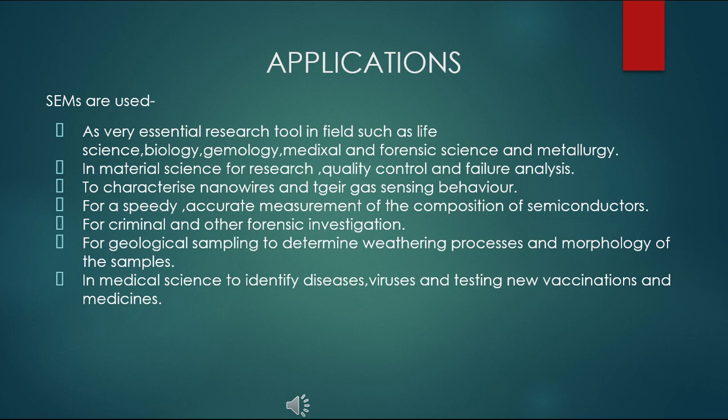SEMs are used for criminal and other forensic investigation. SEMs are used for geological sampling to determine weathering processes and morphology of the samples. SEMs are used in medical science to identify diseases, viruses, and test new vaccinations and medicines.